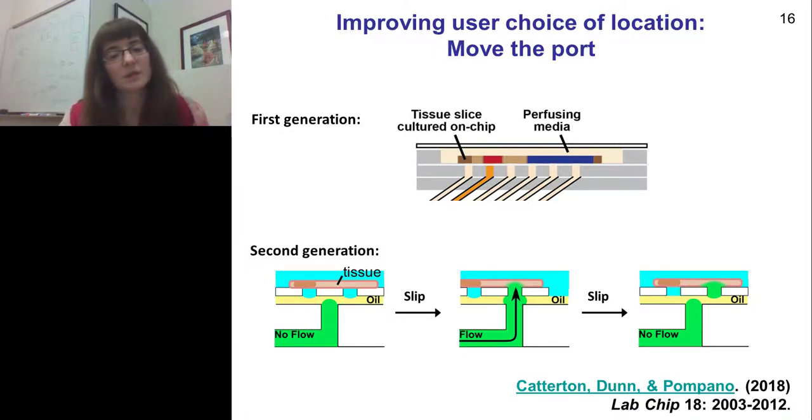in order to connect the port of interest above with the channel below, and then you can turn on a pump and deliver up, and now you have delivery akin to what we had in the other chip. And then we can disconnect again and turn off the pump in order to turn off the flow.